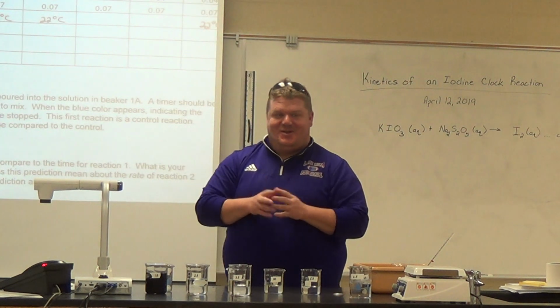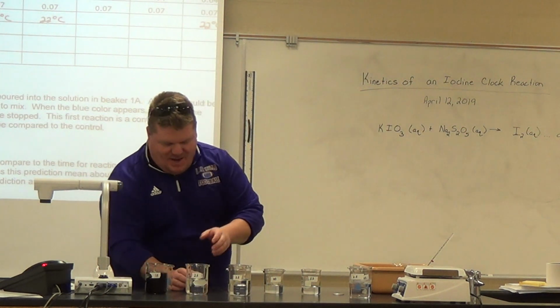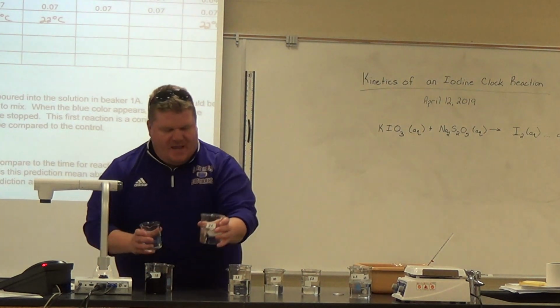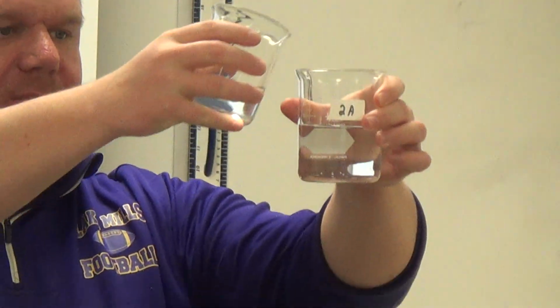Quite the competition here. All right. Shall we find out who's right? Make sure it's clear. Here we go. 2B into 2A. Ready, Adam? Yeah. Okay.